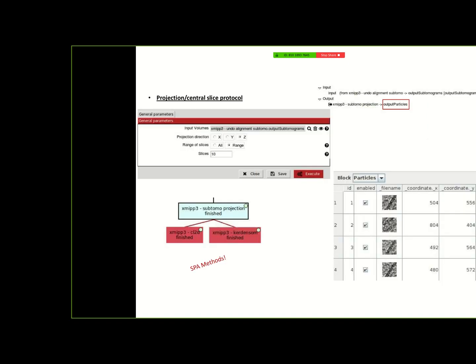Then at some point within the project, we thought that maybe reusing the tools that we had for single particle might help for making a rough classification of the 3D subtomograms. We have a tool that converts the 3D subtomograms, so small boxes, small cubes that you have picked in your tomogram, in the big cell, and makes some operation to convert it to an image.